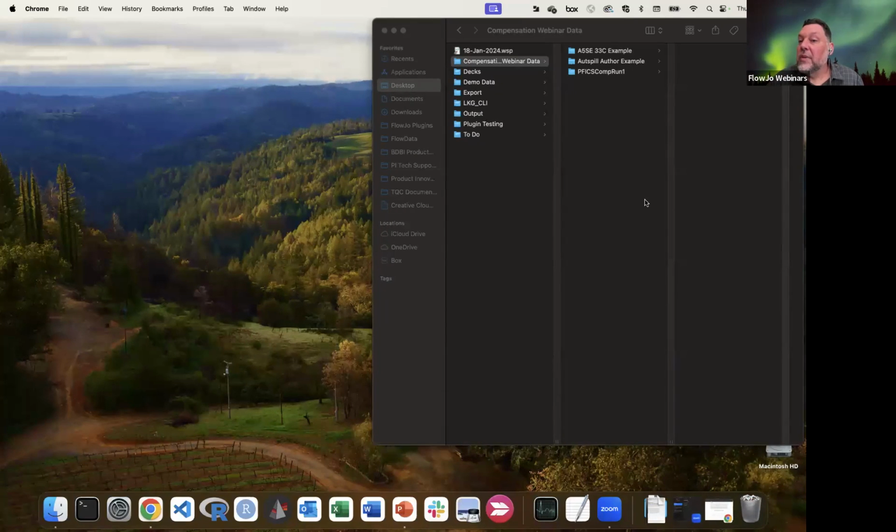Okay, I do have a question. It's unclear to me what you were saying about having all the channels exported when you export this way. So we'll see. Somebody else asks: if spectral unmixing doesn't look right, is it okay to export as FCS and then redo the spectral unmixing in FlowJo? Does that give the same results as Diva spectral unmixing? The answer is yes, you can.